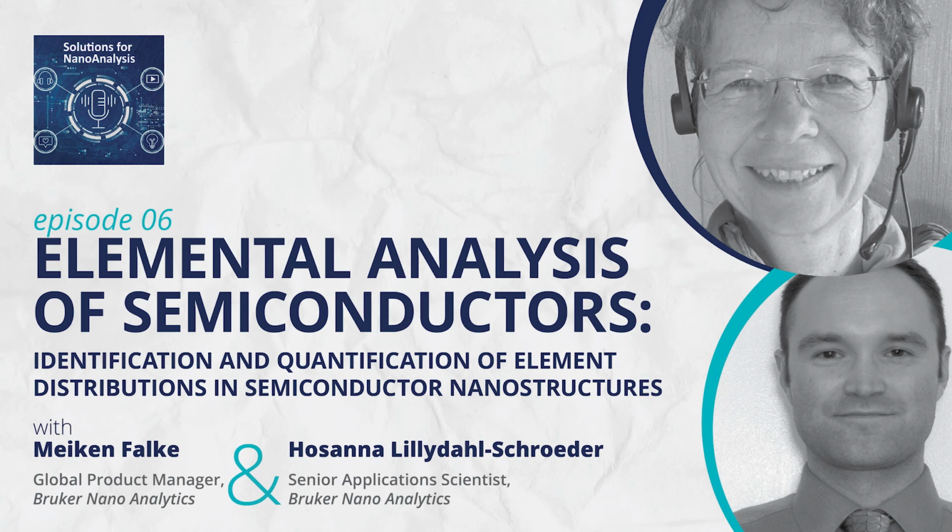Yeah, you are right. So the two techniques are kind of overlapping already. If we come from TEM, we could first speak about doing TEM in SEM. Of course, one can put a TEM sample into an SEM. It's actually being made in an SEM, so in FIB, right? And it is amazing what is possible in SEM with electron transparent specimens.